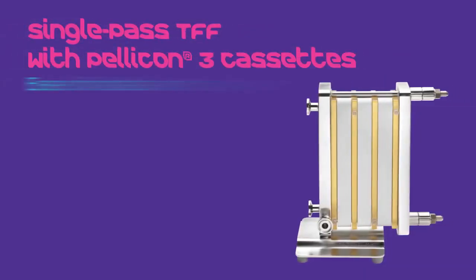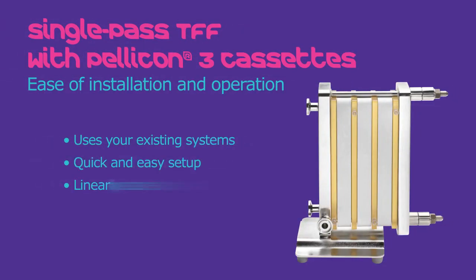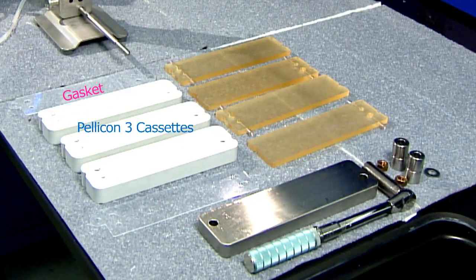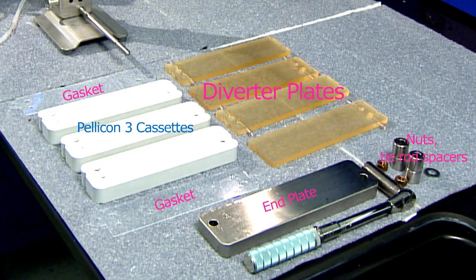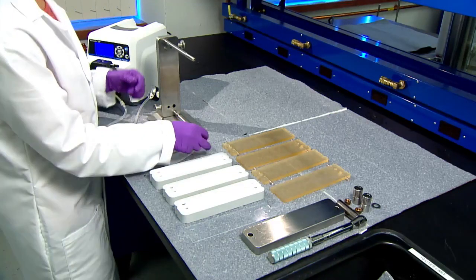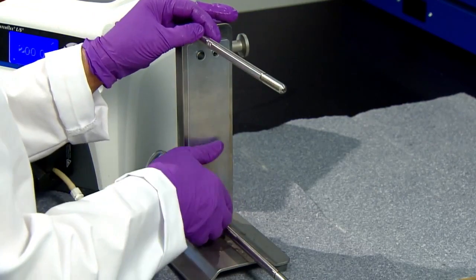In this video, we will show you how to install Pelican cassettes into a single-pass configuration. It's actually fairly simple. A three-section single-pass experiment requires a kit which contains gaskets and diverter plates. In addition, you will need three small format cassettes each of the same size, hardware for your holder, and a torque wrench. Always start with a gasket against the end plate to avoid leaks.